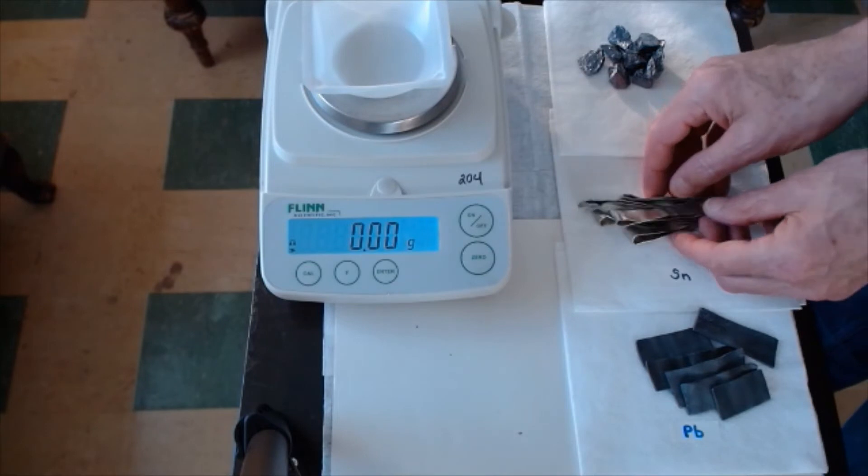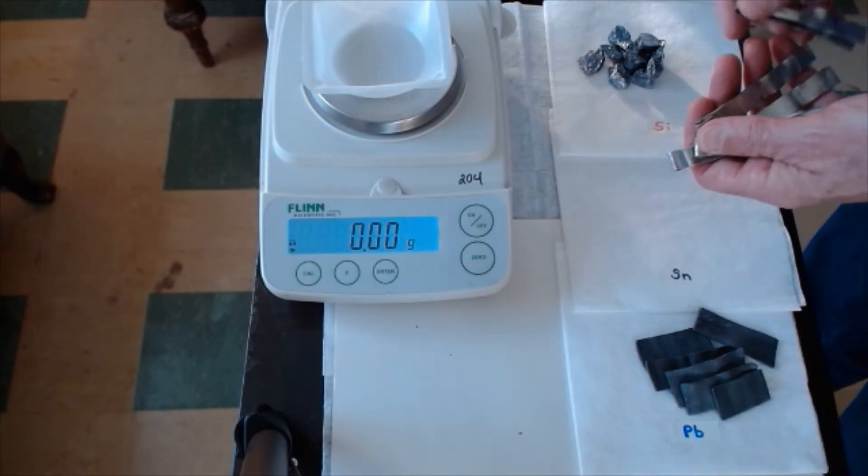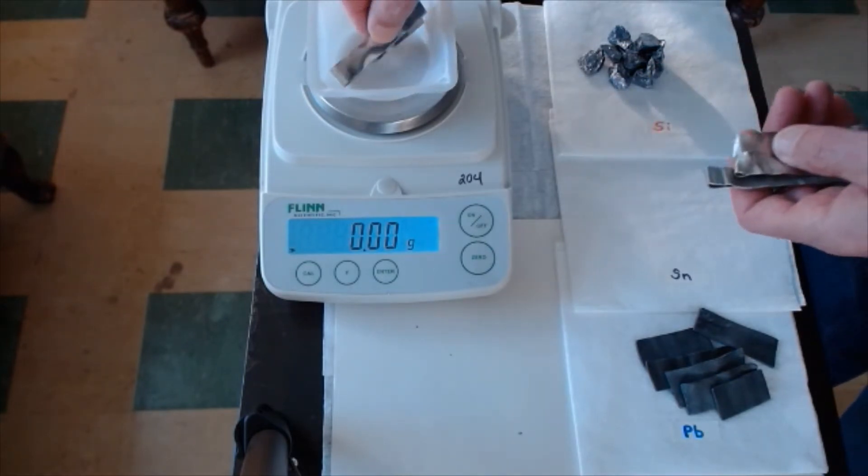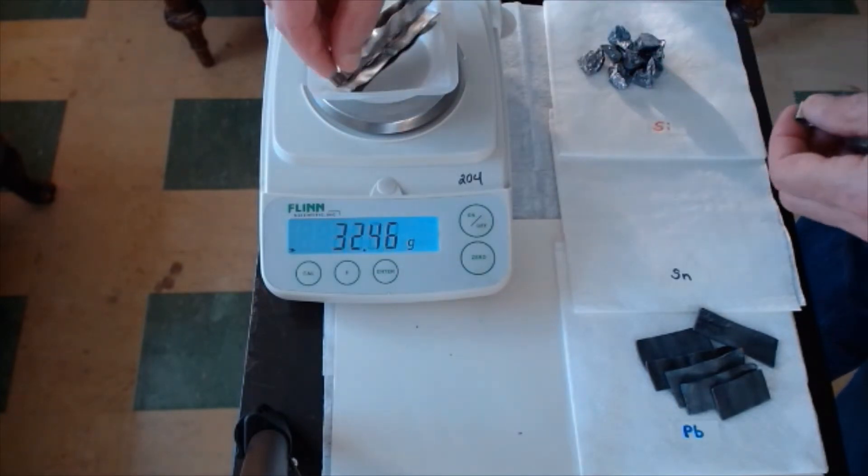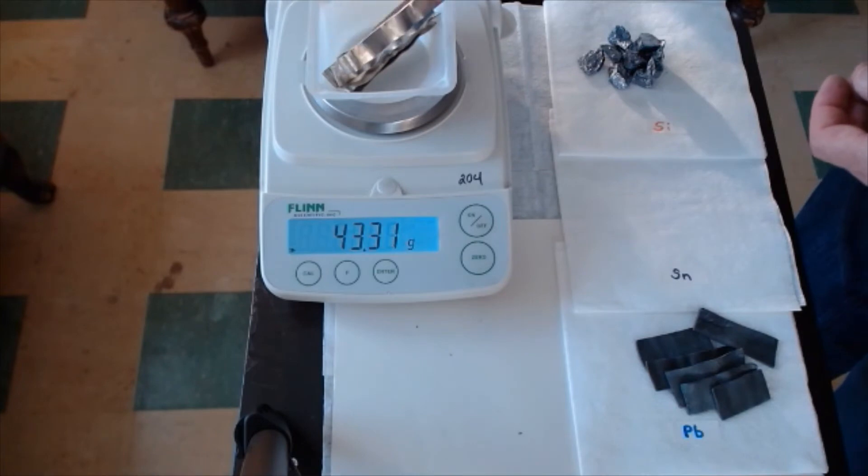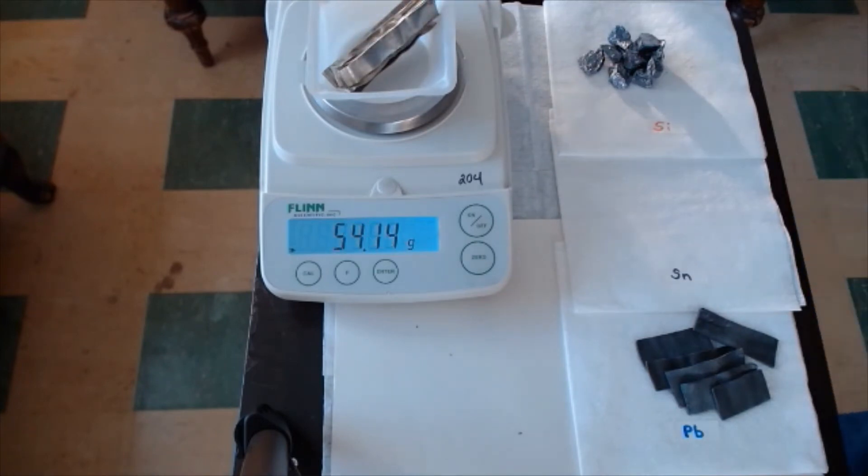And that's the mass of the tin pieces. We're just going to set all those pieces down into the weigh boat. Wait for the scale to settle down. Okay, our tin pieces, 54.14 grams. Great.